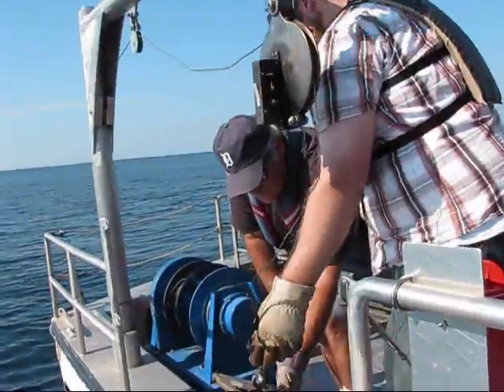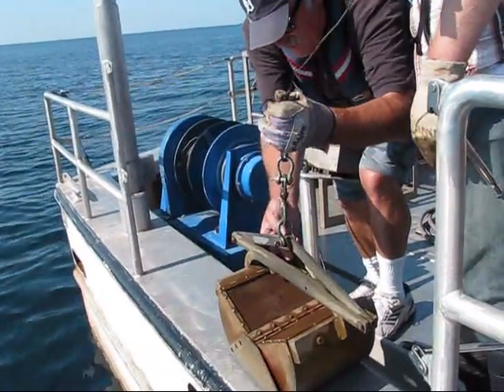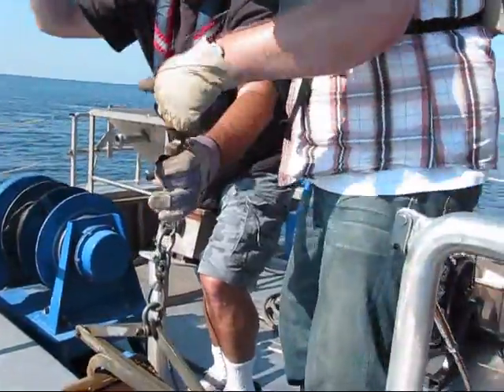I'll show you something. See this thing right here? That's a trigger and it catches right there. So the way you set that trigger, pull up. And you've got to keep tension on it, otherwise if you let go, the trigger falls down. So keep tension on it. Tension on it. Got it.